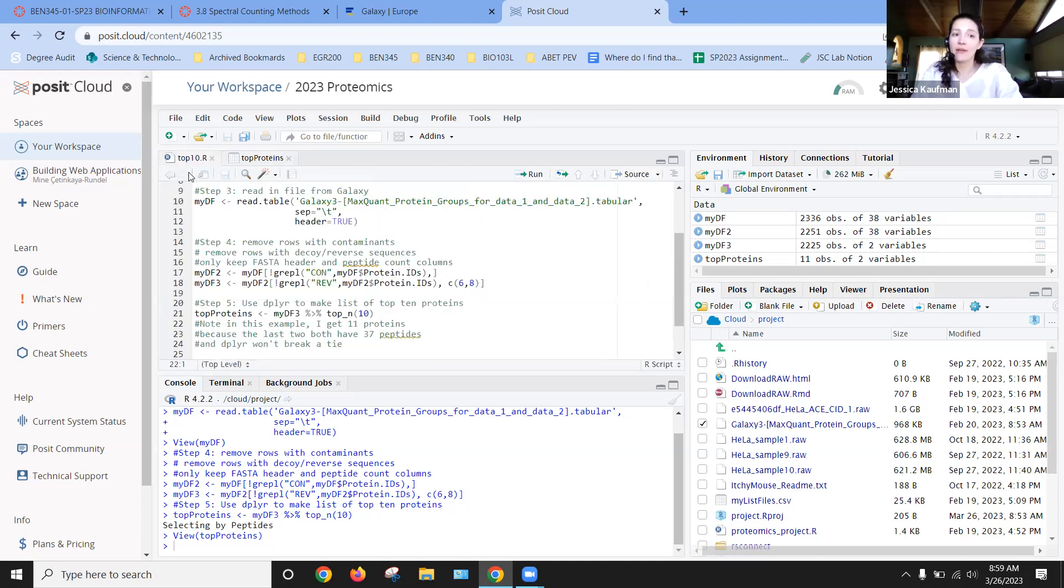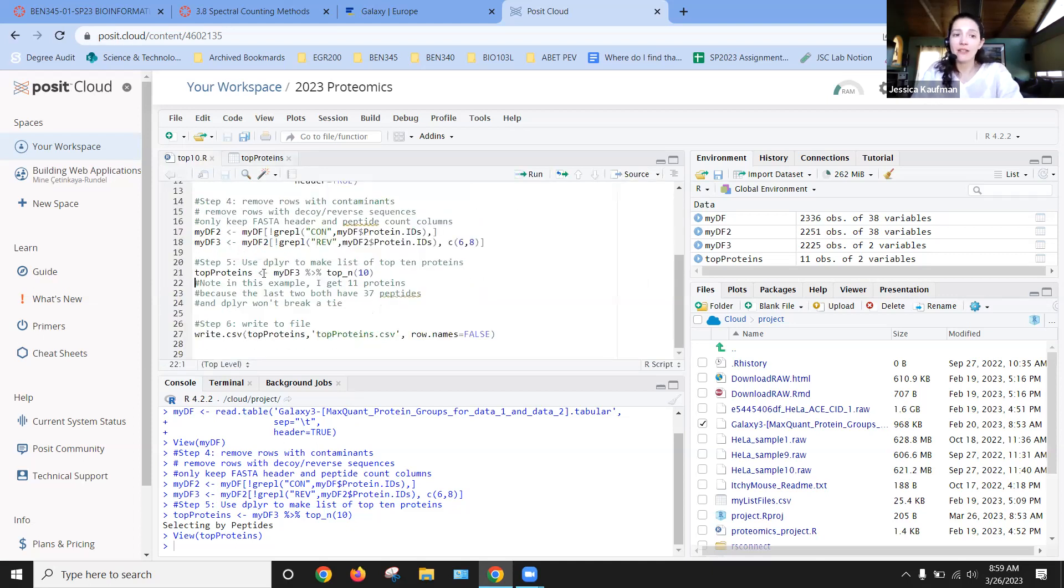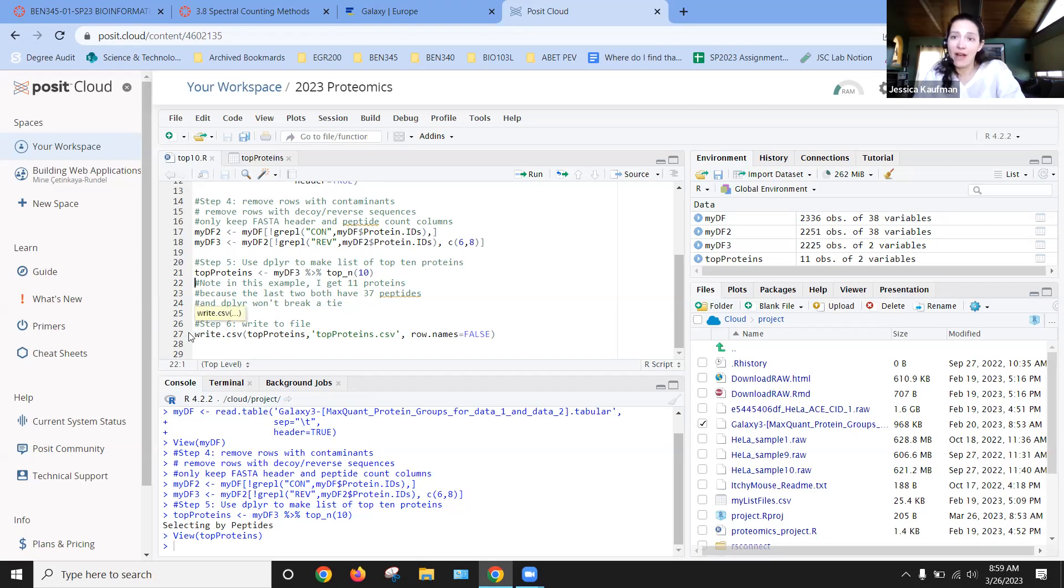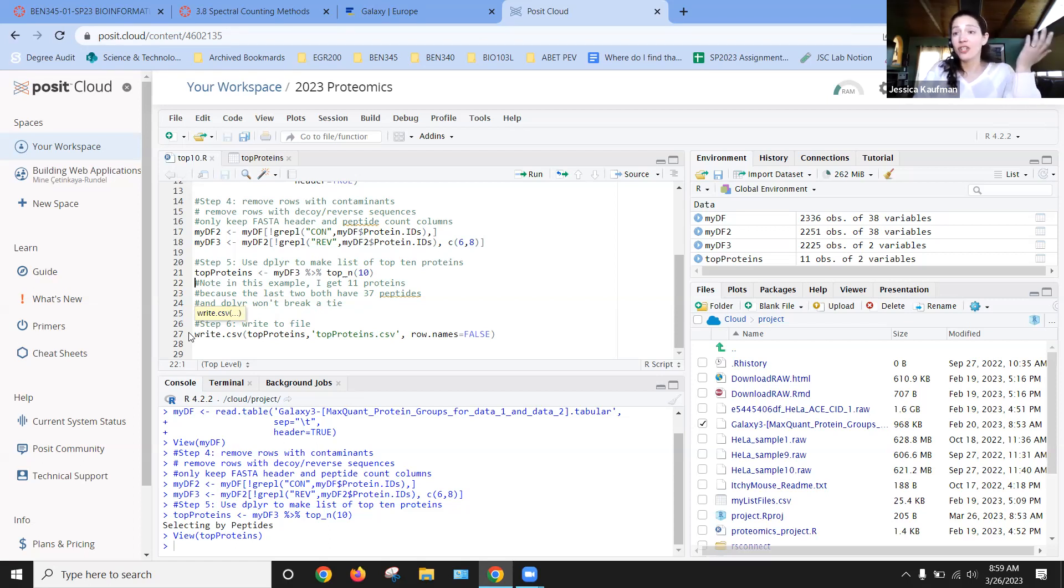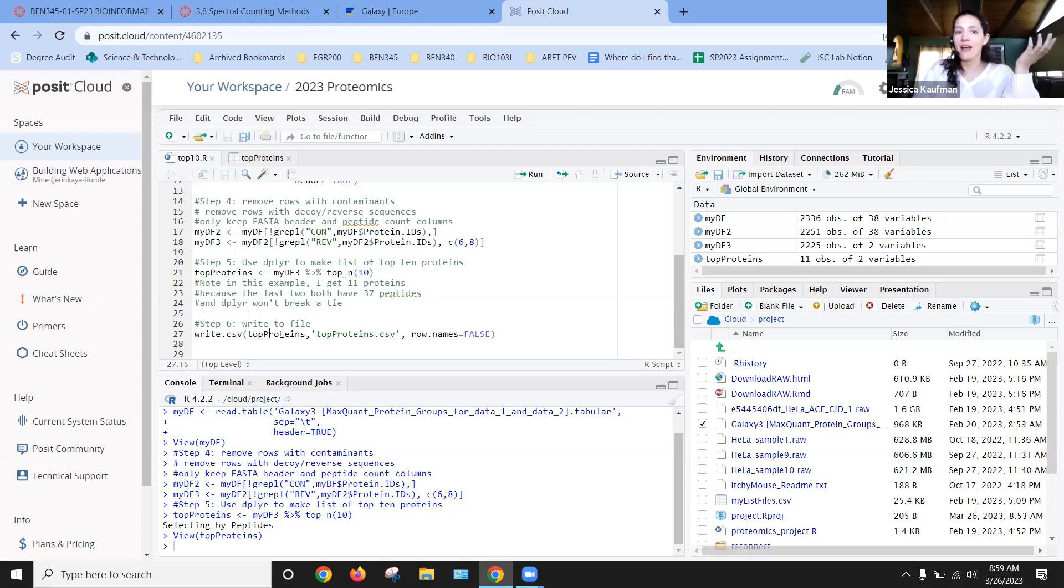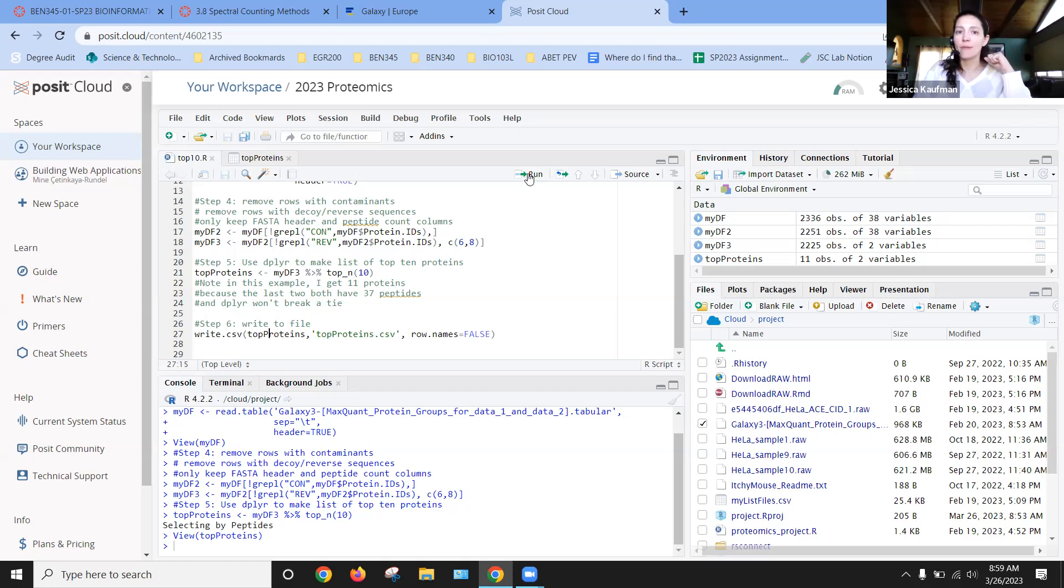So now I know what the proteins are. And I have in my code comments, I get 11 proteins because the last two have 37. And I'm ready to write this to a file that I could email to someone who didn't use R, that I could share with anyone, or that I could even go into a PowerPoint presentation. So if I was creating a poster for my senior thesis, I might want to write to a CSV file just to start making that table and formatting the table.